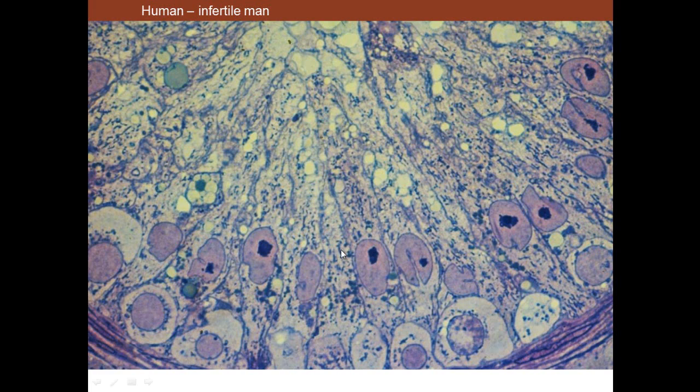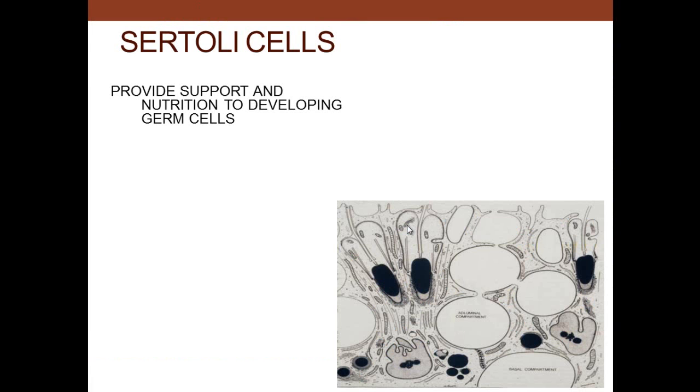All those are indicative of metabolically active cells. So the nuclei that we see here are really from the Sertoli cells, and they extend from the base to the lumen, and they take odd shapes. You can see the elephant here, the alligator, you can see Pac-Man, different things you can see in the shape of the Sertoli cell nucleus.